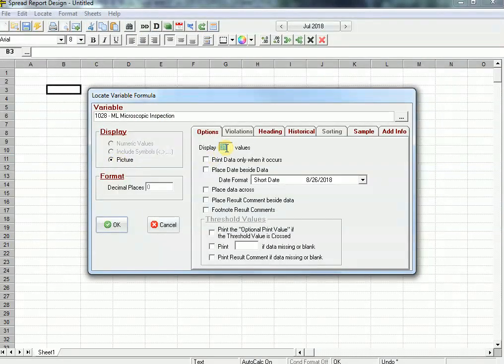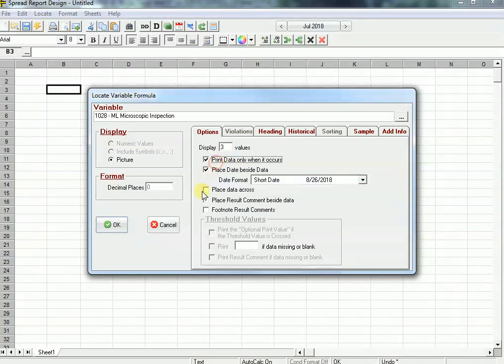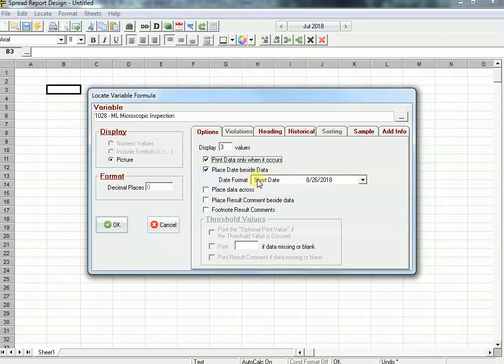Let's say since I do it a couple times a month but I may do it extra, I'm going to say I want to locate up to three values. Print data only when it occurs. I have to place the date beside it. I go ahead and click OK.